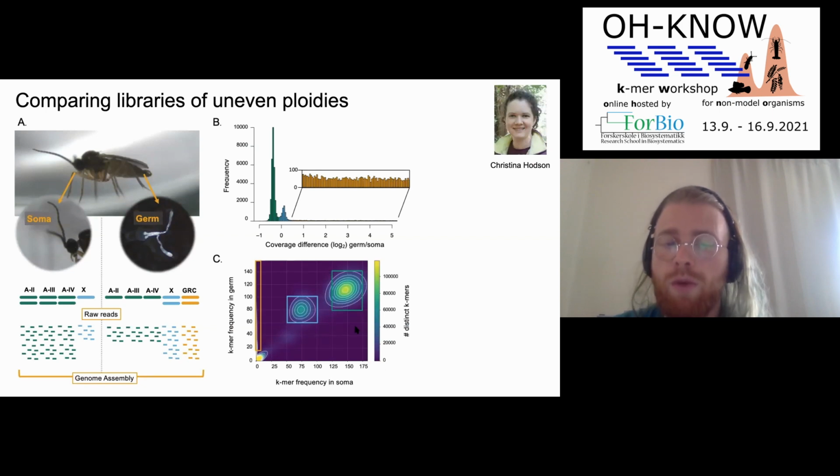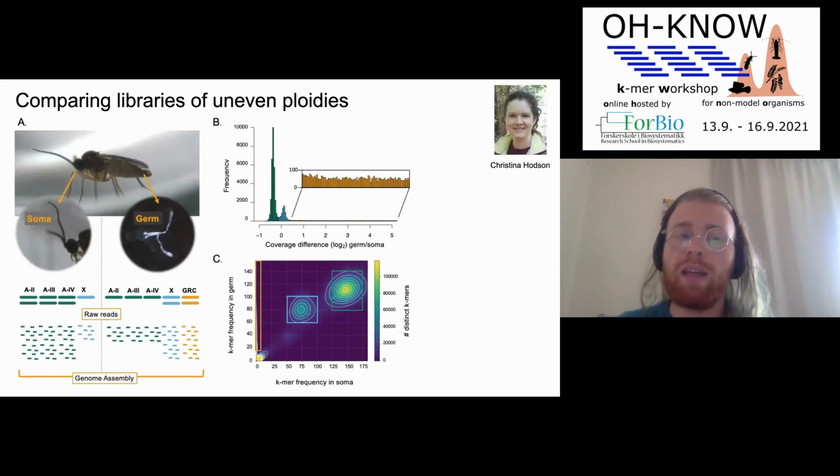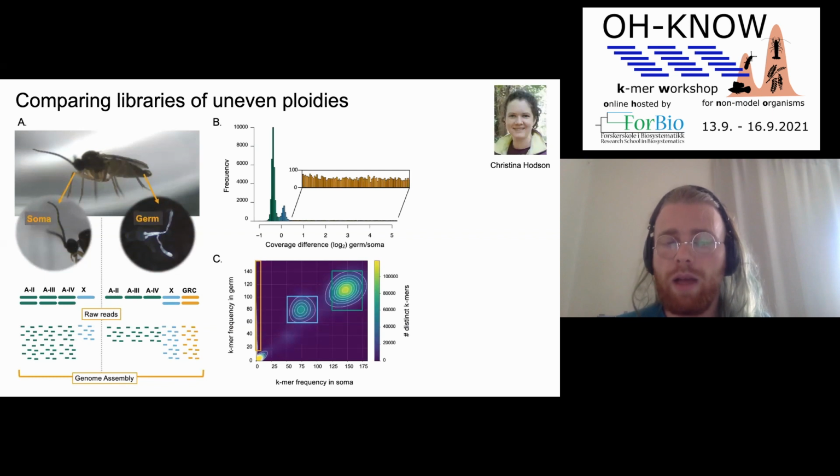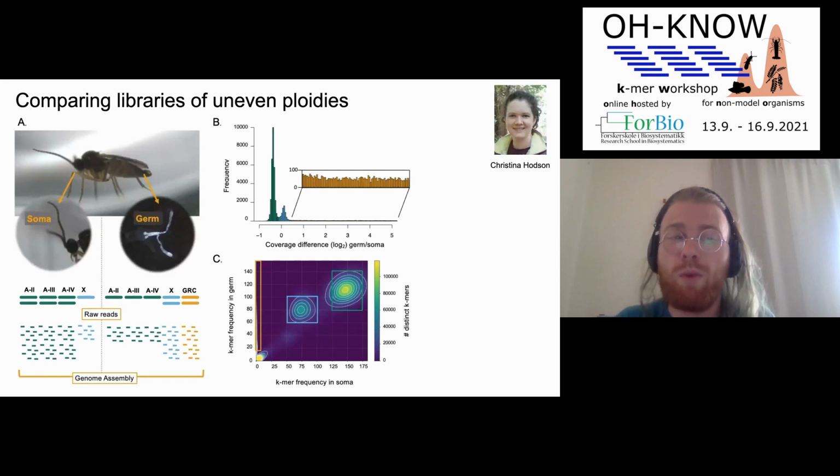Then we will count for every single k-mer how many times it is found in male and female reads. And then what we can do is say, give me all the k-mers that are found in one genomic copy in at least 3 out of 4 males and 3 out of 4 females, or something like this. So we can use the power of having more than one individual to decide which k-mers are really sex specific and get the purity out of the number.